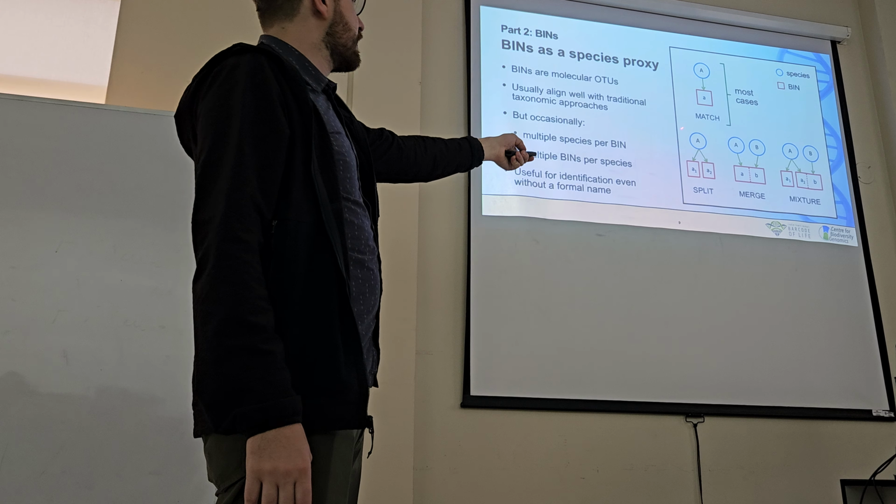This week I'm going to try to meet Gerardo Ramos to see if we can make that 10,000, if he lets us. So you can see many of these records have bins and good quality sequences. There have been 2,300 records with bins here, 1,000 unique bins, so very diverse. And of those bins, 893 have species names. These have been found in 3 countries, meaning the specimens are from 3 countries, so Peru and probably a couple others, we can see a map, but only one institution.